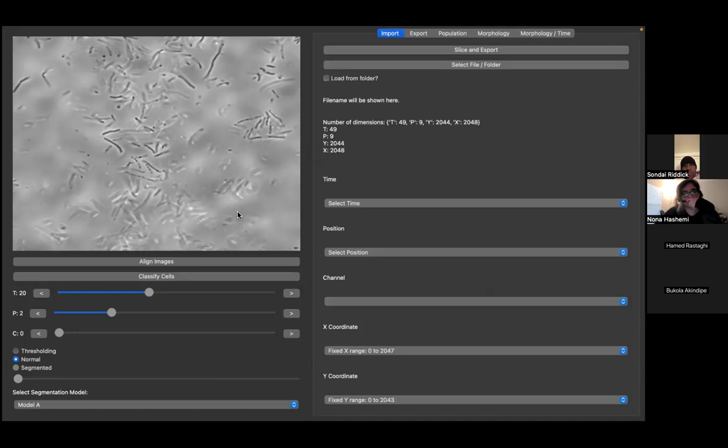And yeah, it's just for this first time, we are optimizing the tool to make sure that we don't have this delay in loading time. Almost there. Oh my God.